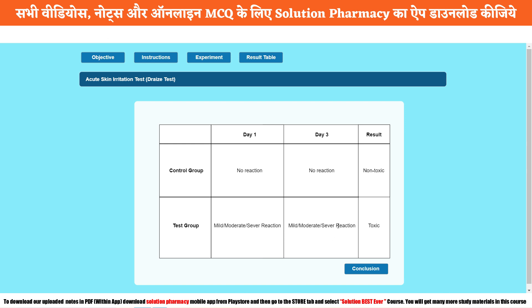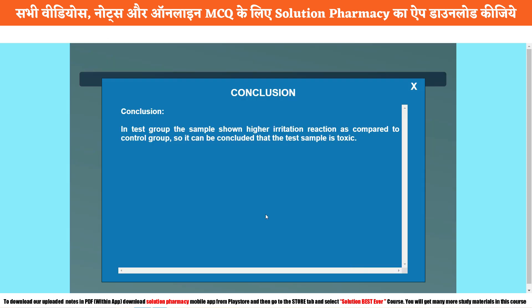These are the possibilities — what you observe should be noted in the observation notebook. The final conclusion is that the particular test substance applied over the skin of the rabbit was found toxic. Click on the Conclusion tab and you will find that in the test group the sample showed higher irritation reaction as compared to the control group. It can be concluded that the test sample is toxic. That was our today's practical to study the skin irritation test of the given sample. Thank you so much. Namaskar, take care.